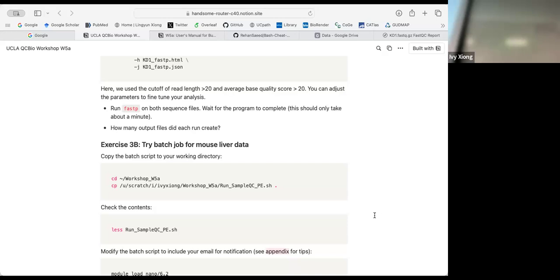I ran it from here, in the workshop. I think it's written out as fastp.html. So some of us have seen that. It's not written out with the title, it's just written out as a generic name. I think that's something to do with the space and the backslash. So that's usually the same thing. Okay, all right.